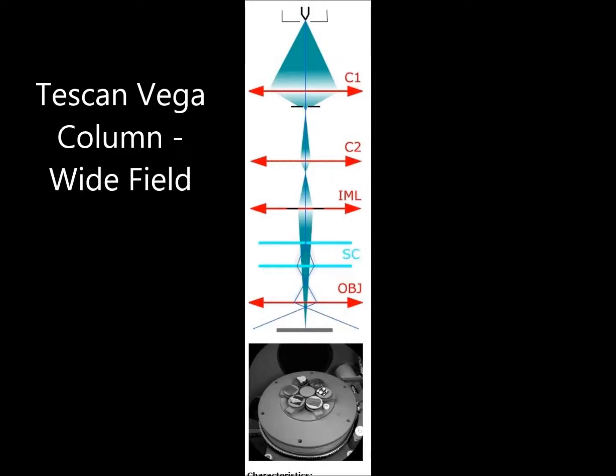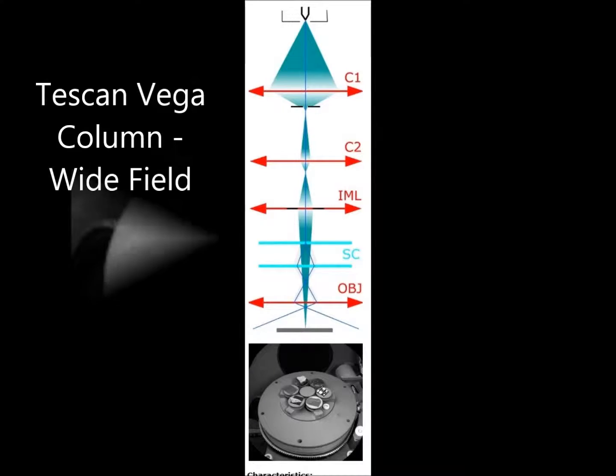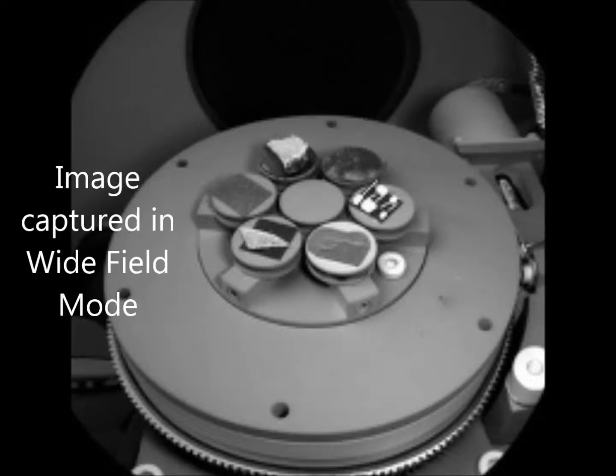The mode is used for searching for parts of the specimen for analysis or investigation. To know the proper magnification value, the objective must be well focused. This might be a bit difficult due to the high depth of focus. The purpose of this mode is for an extra large field of view. Image distortion is corrected and minimized.